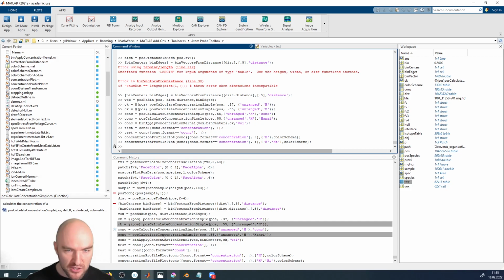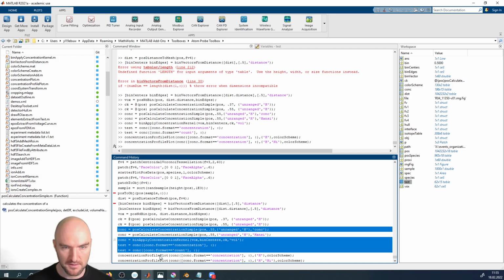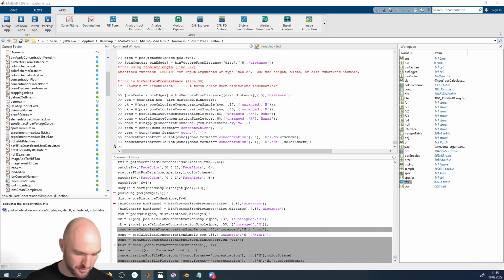Okay, let me just copy all of that stuff into... again, flexibility and scriptability. That's the important bit. So if you have a certain type of analysis that you want to do, I think you could see that a lot of that, the interface creation in this case for grain boundaries, we won't get around having some manual interaction there. But apart from that, once you've done that once, you can just go and take all of the commands, copy them into a script.